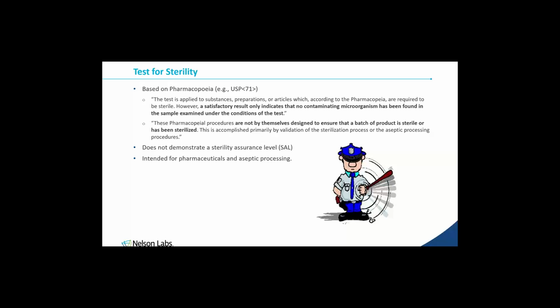So maybe you should define aseptic processing versus terminal sterilization. That's a very good point. Aseptic processing, also sometimes called sterile processing, is where I'm relying on everything I'm bringing into the system being sterile already. So chances are it's been sterilized in one way or another. Let's say I have a vial with a pharmaceutical in it. Well, the vial has been terminally sterilized, and we'll say what that is in a second. But then I have the pharmaceutical.